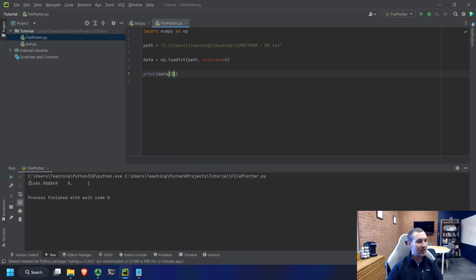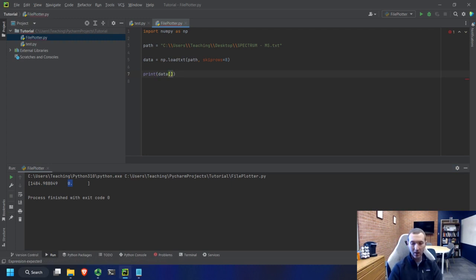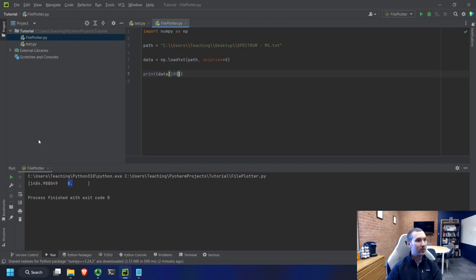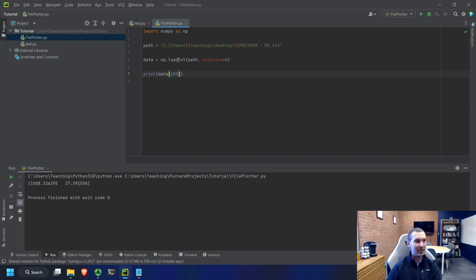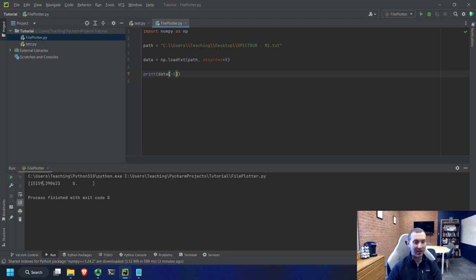And you can see we have the m over z here, which is 140.84, and the intensity, which is zero, right? So we could go through and say, let's grab the 100th data point. Run that. And you can see now we've got one that's a little later. It's got a little bit of intensity. We could say grab the 1000th data point, right? And it would do that. We could say grab the last data point, which is minus one. And you can see that's now at 1500, all the way at the end.